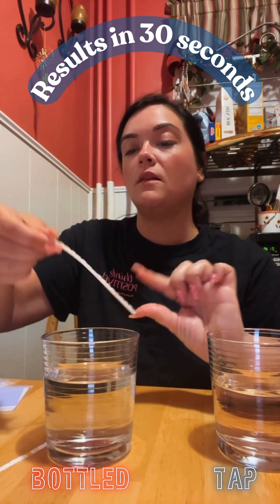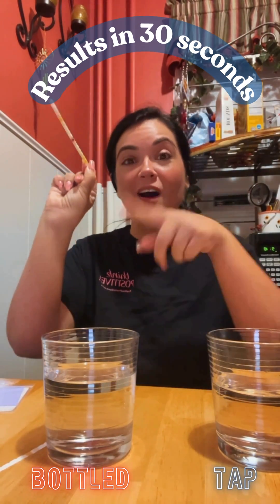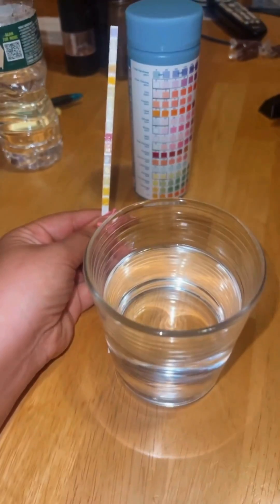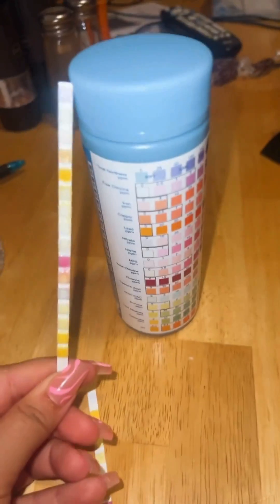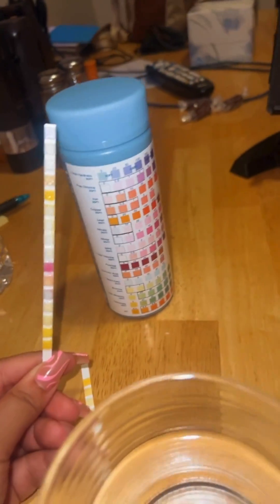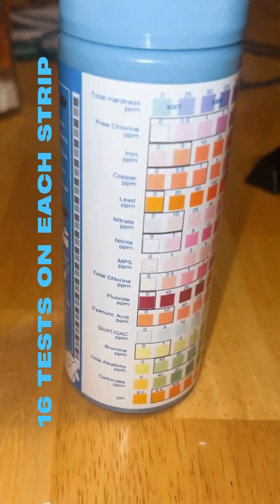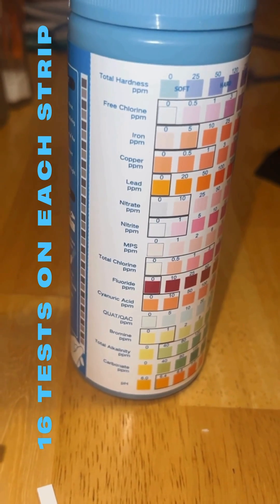We're going to wait and then compare the colors on our bottle. When comparing the strip to the colors on the side of the bottle, it's not that bad, and it's super easy to compare colors — it tells you literally everything that you're looking at. It's amazing.